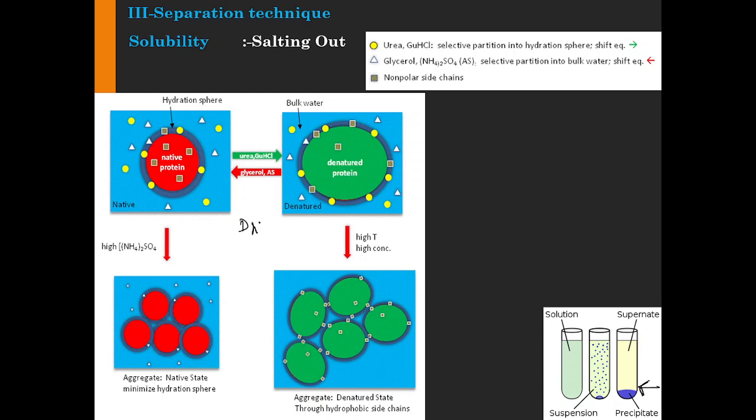Once you precipitate it, you have preferentially extracted your proteins from the rest of the components. Obviously for DNA and RNA, you get rid of them by giving DNase or RNase treatment, the same way you give protease treatment, and we will talk about that in our protocol discussion. So that's how you basically precipitate.